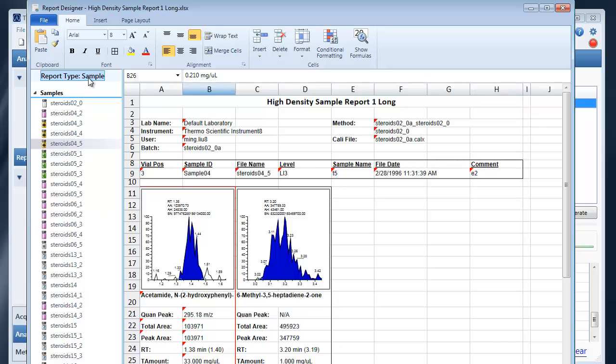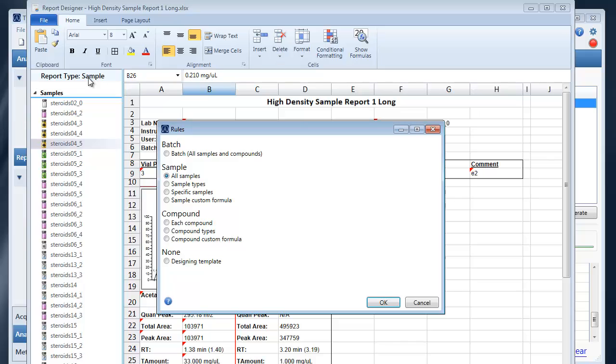First you'll probably want to set your reporting type. You can set it to either batch which will repeat the data for all samples and compounds or to sample or to compound. Here we have the high density sample report which is a sample report.